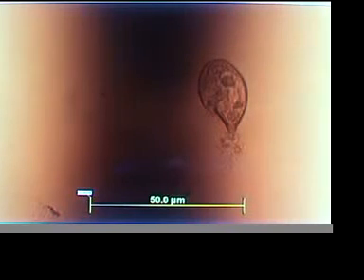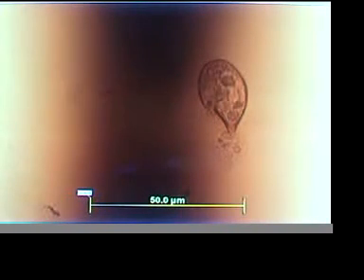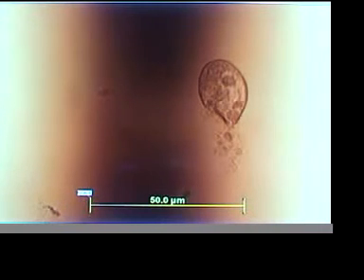It's in the same square. Real time. The black line you're seeing is a grid line on the new grid slides. So here's 2 organisms happening in the same box on the grid. And I will identify that box as soon as they stop devitalizing.